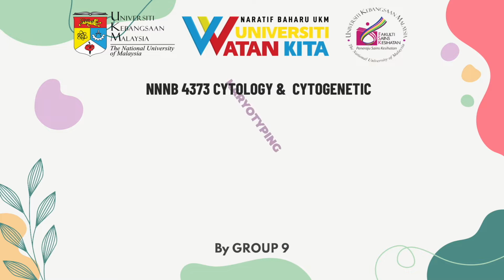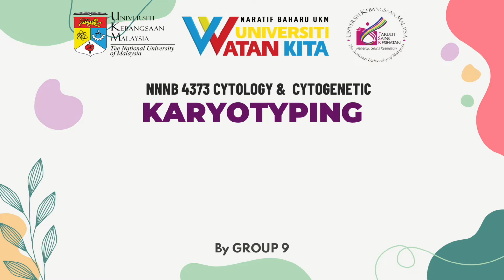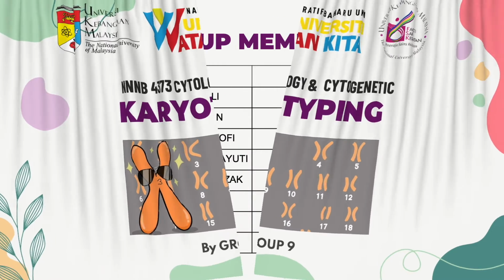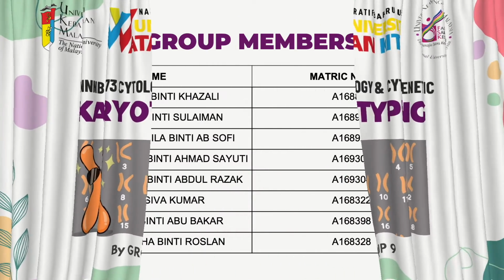We'll be presenting about karyotyping and how we can recognize the normal and abnormal of human chromosome. Shall we begin? Let's go! First of all, here are our group members.